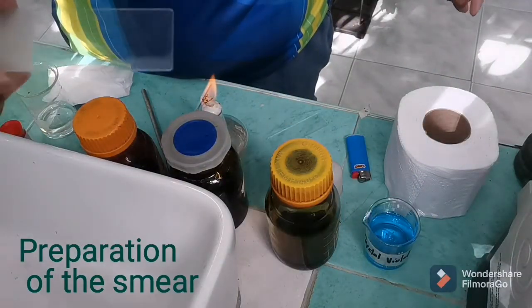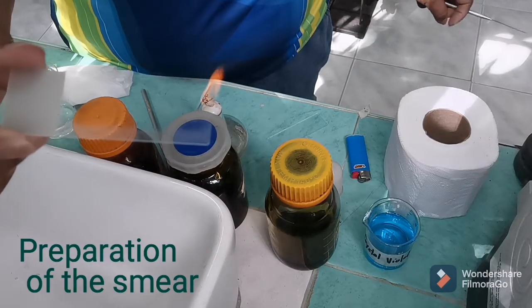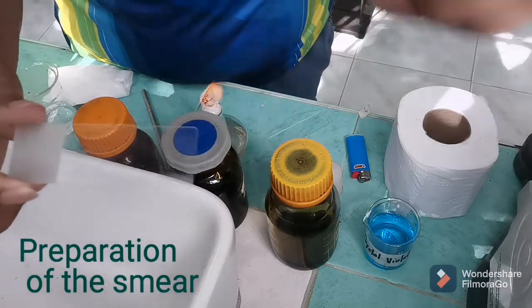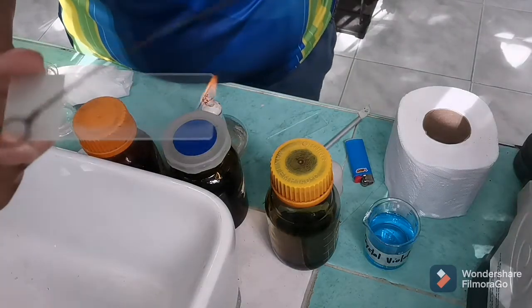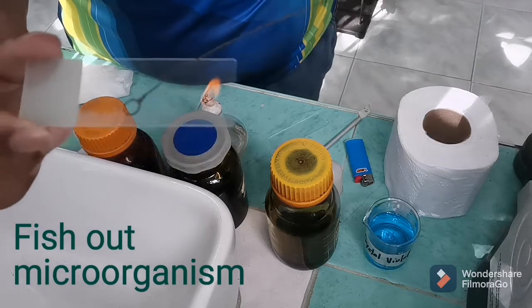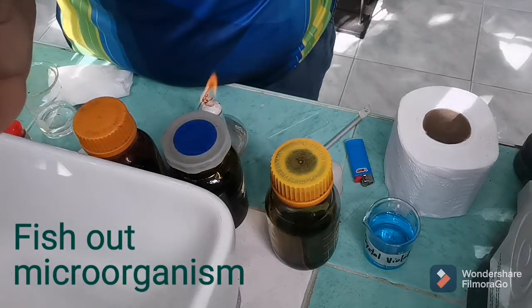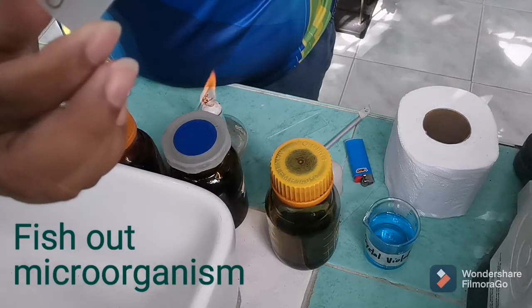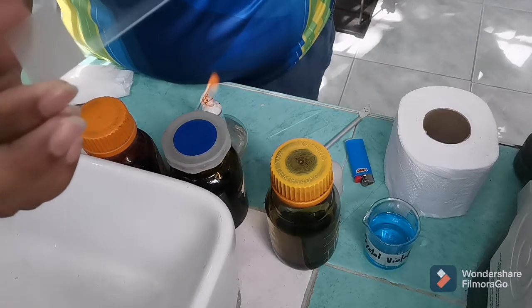Okay, I have with me the glass slide that we will be using to place the specimen, and I have with me the inoculating loop in order to fish out the microorganism. So from the loop, I will fish out some microorganisms and will place it here.